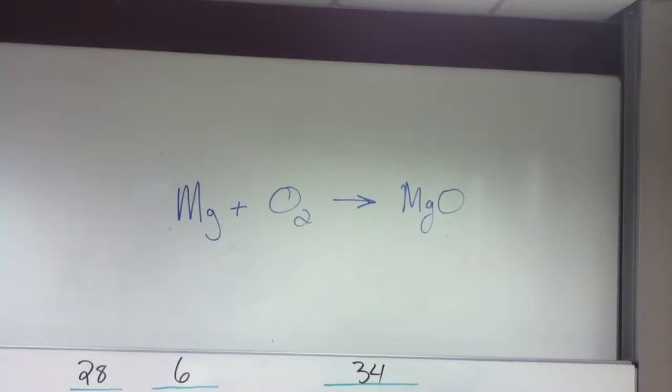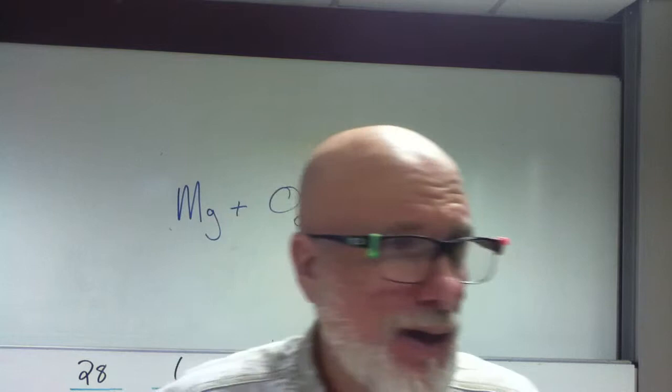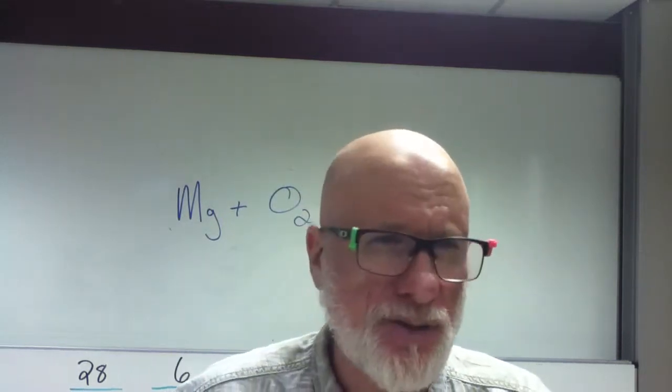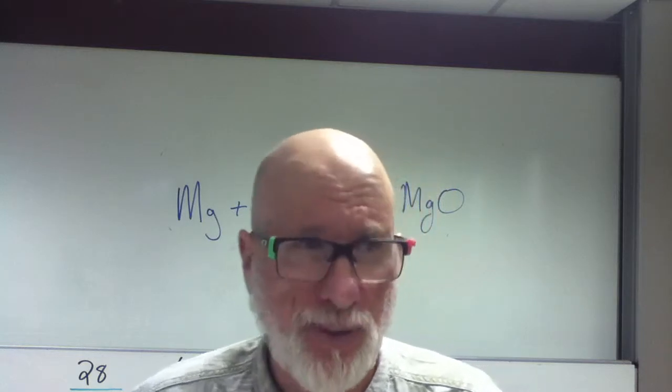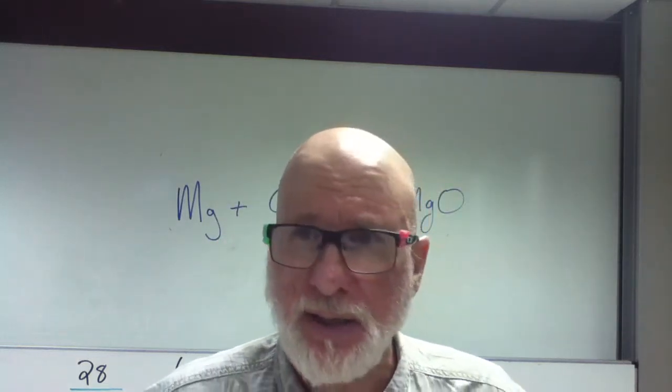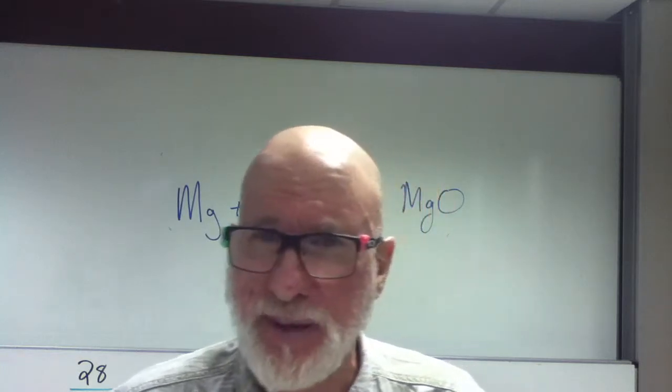Okay, this is Prelab, magnesium plus oxygen. I've had 3 Prelabs, but that was an introduction to lab work. This is actually an introduction to the lab you're doing today, so you have some kind of idea of what you're doing. So you can notice what's happening in nature.